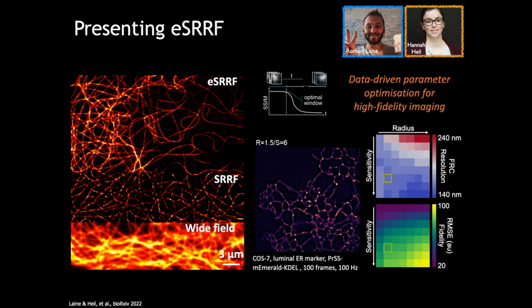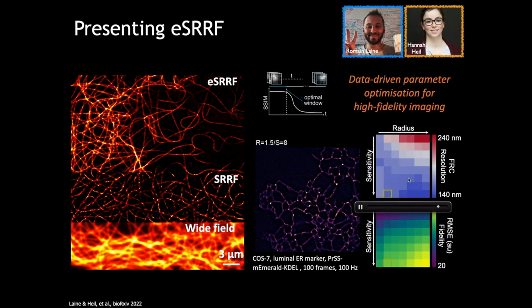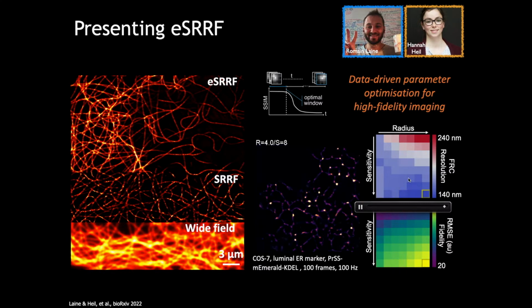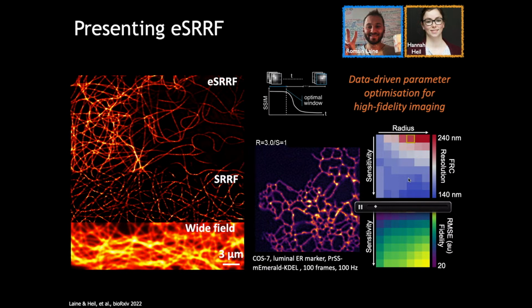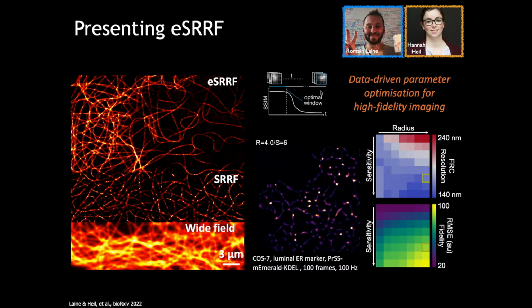And you're seeing a little bit of what the algorithm is doing here, right? What it's going through is constantly calculating resolution maps, which are calculated by FRCs, and constantly calculating quality metrics, which are calculated through the Squirrel algorithm that we created a few years back. And it's also looking at how much motility the data has, because it works on the assumption that fluorophores are oscillating, but having almost no motion in the data. And with that, it means that it's also finding exactly what are the constraints of the parameters that it should use to then make that super resolution estimation.